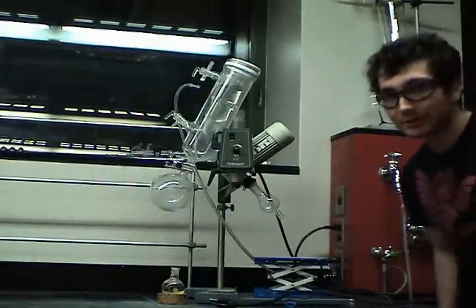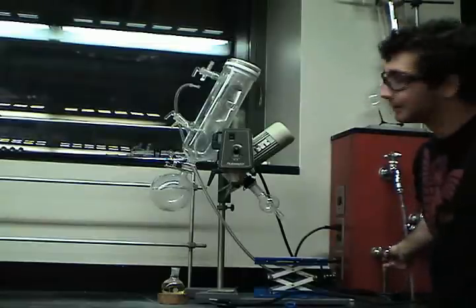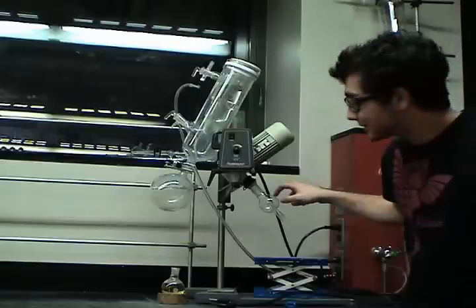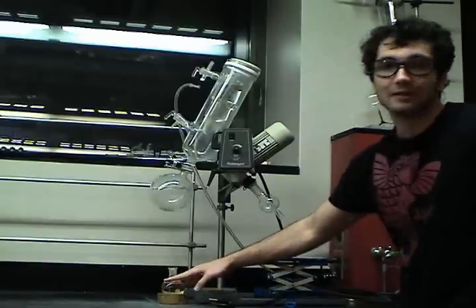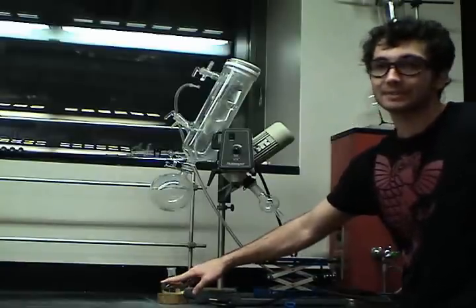The way this machine basically works is by pulling a vacuum from an aspirator through the machine, which lowers the pressure on the inside. This makes it easier for the vapor pressure of the solvent to match the atmospheric pressure, which is decreased. And when that happens, the substance boils.